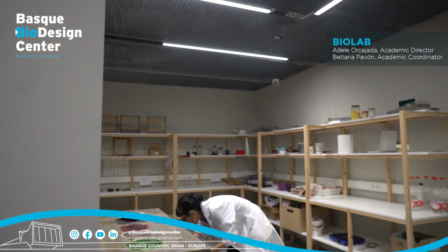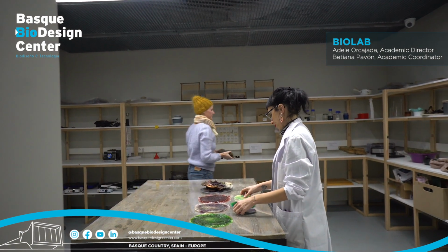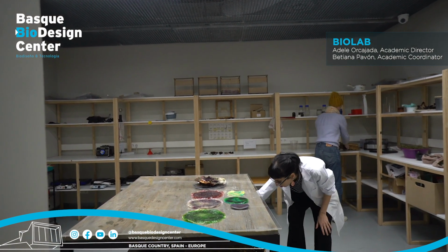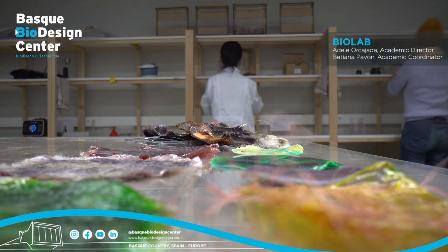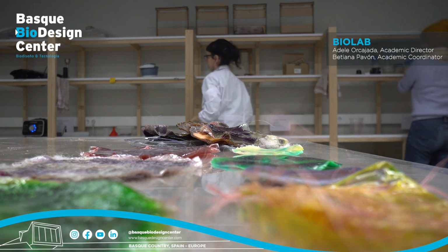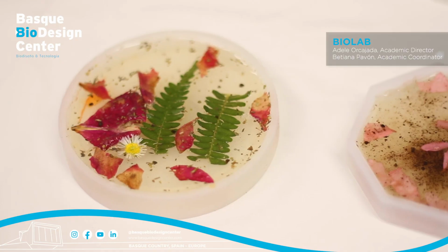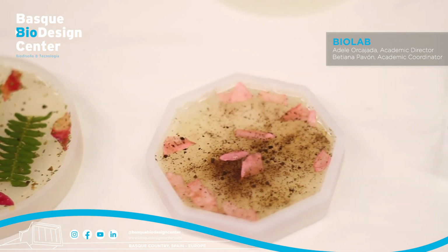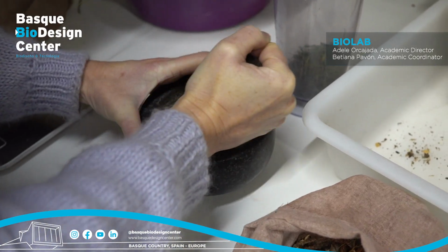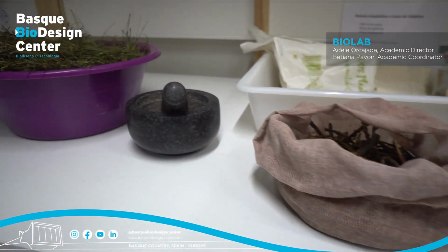And this is our biolab, one of the most fun and creative spaces inside the center. This is the place where we can really put many of our ideas to test. We can be creative and innovative and really push boundaries. We've got different kinds of equipment. We've got a dehydrator where we can put all the food waste from the center, which we then store and keep to use for experiments, like coffee grounds or tea grounds, orange peels, etc.